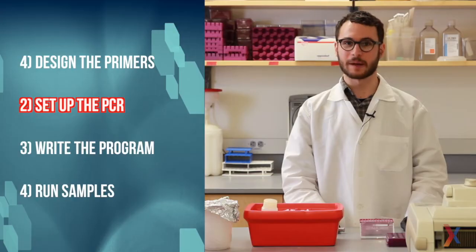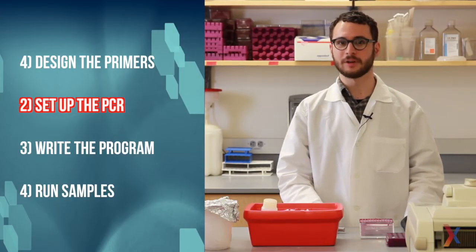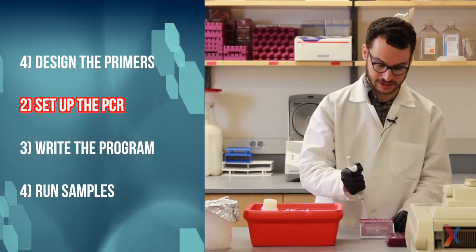So now it's time to set up the PCR. I'll be adding the components from largest volume to smallest volume. First is water.